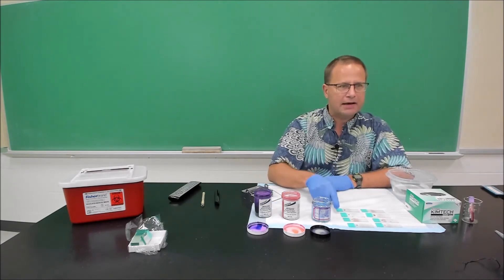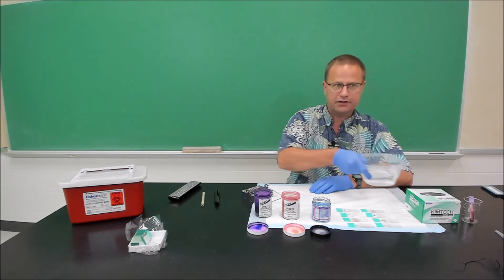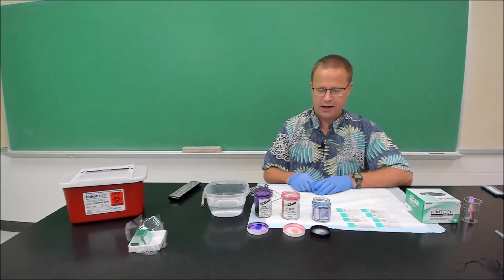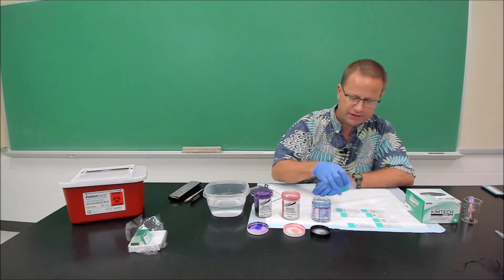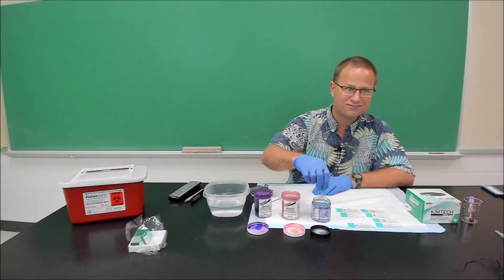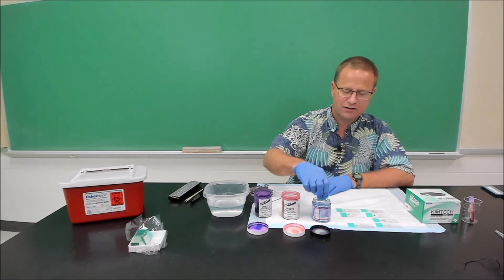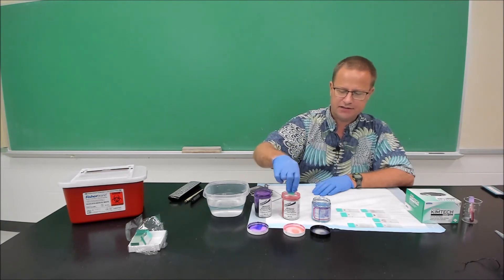So just choose your best blood smears, and then we're going to go through the process of putting them in all three of the solutions, and then we're going to do a rinse and water. Now, so I'm going to pick my best one, probably that one right there, and I'm going to do ten dips in here. And get the excess fluid off there. Ten dips in the eosin.